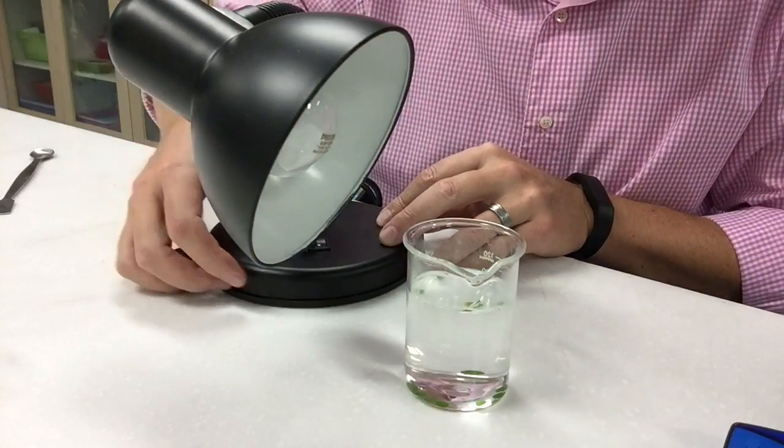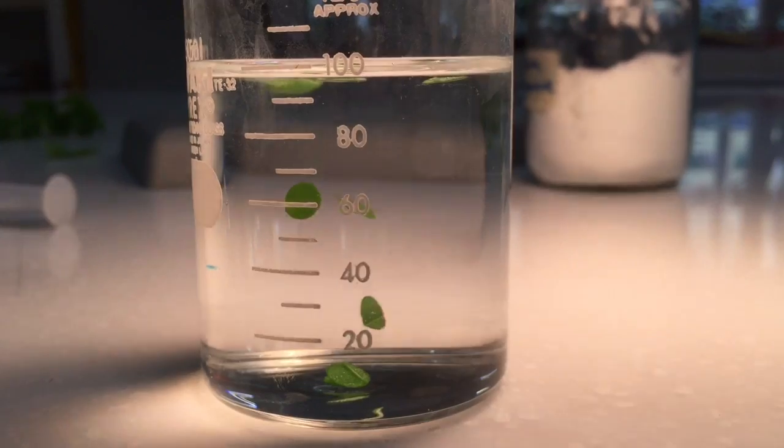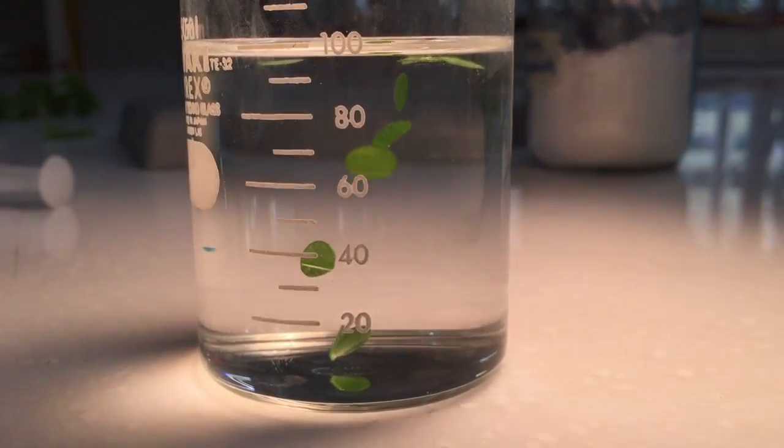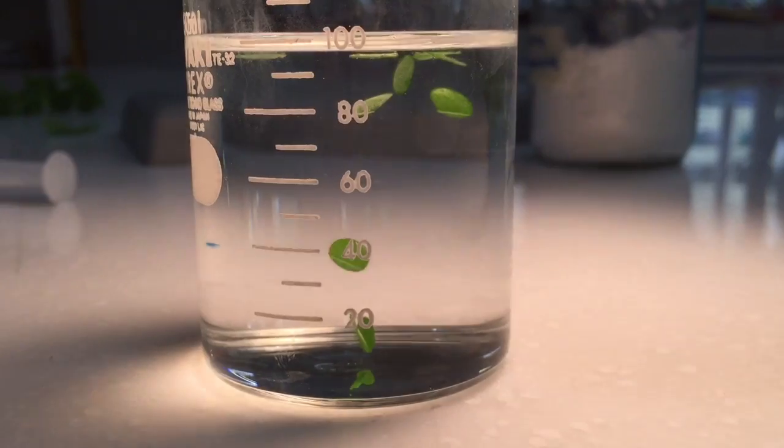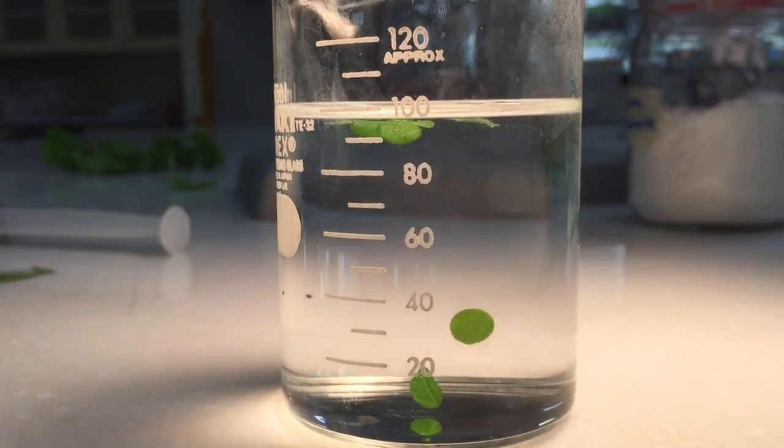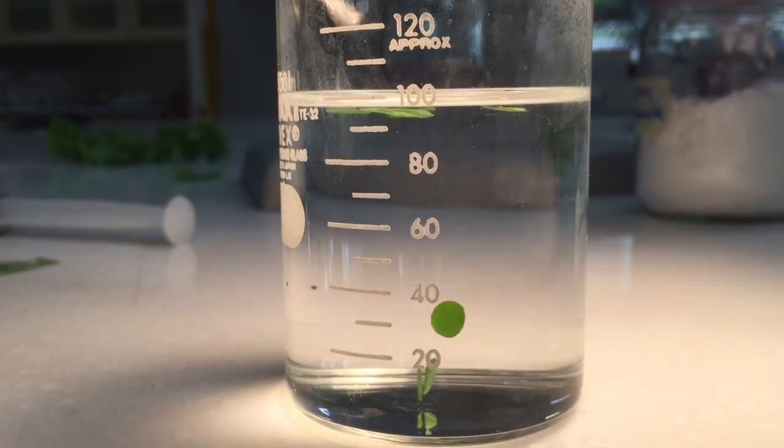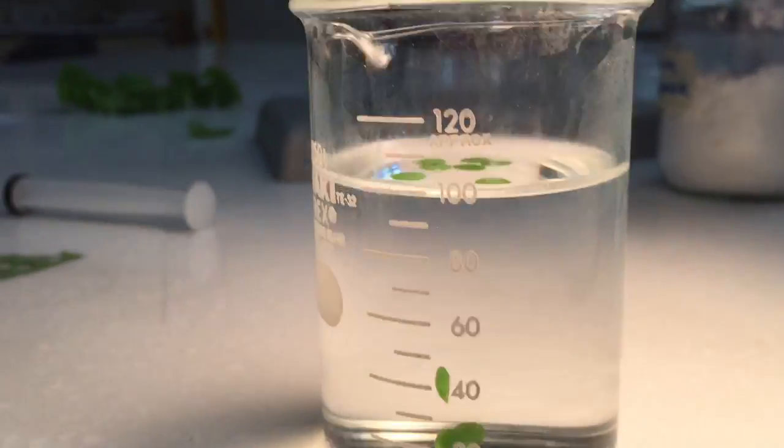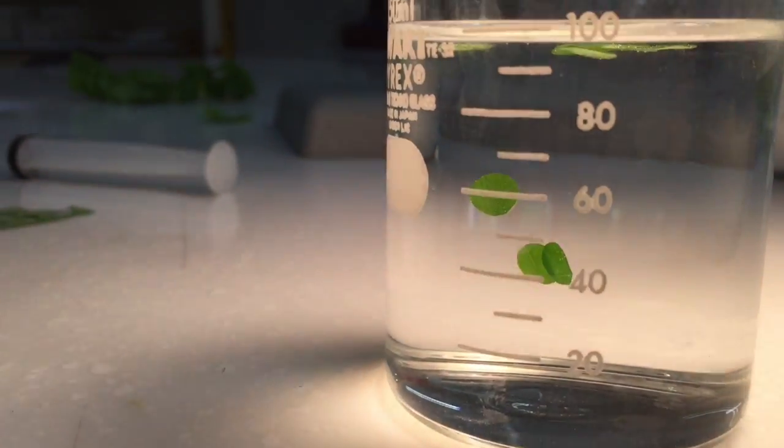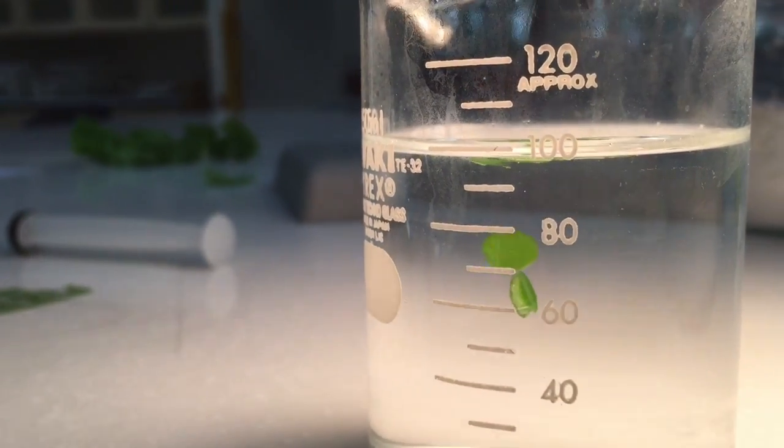So what I've got now is I've got the light shining on the leaf discs and I've actually swirled it up a little bit so that, you want to do that every once in a while, you can see that some of the leaf discs have already come up whereas other ones are still on their way up. So there you go that's kind of what you're looking for.